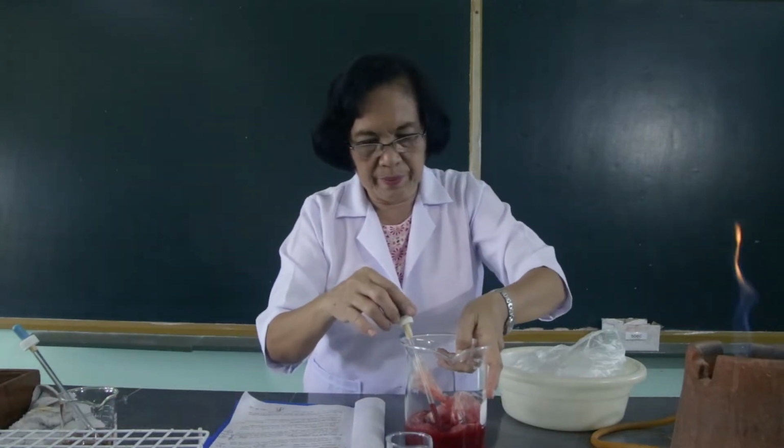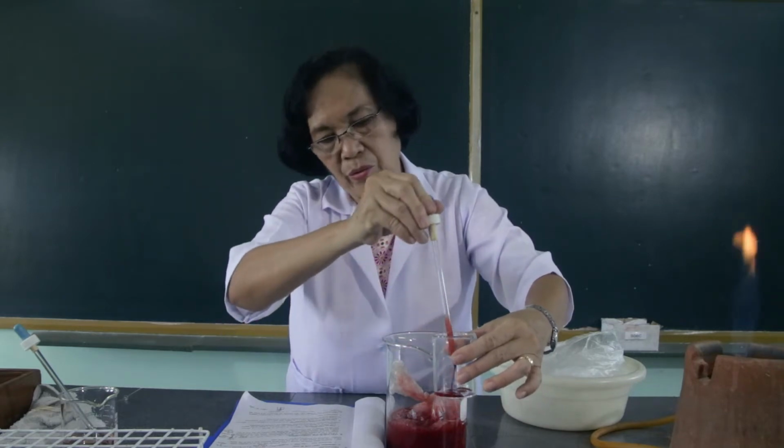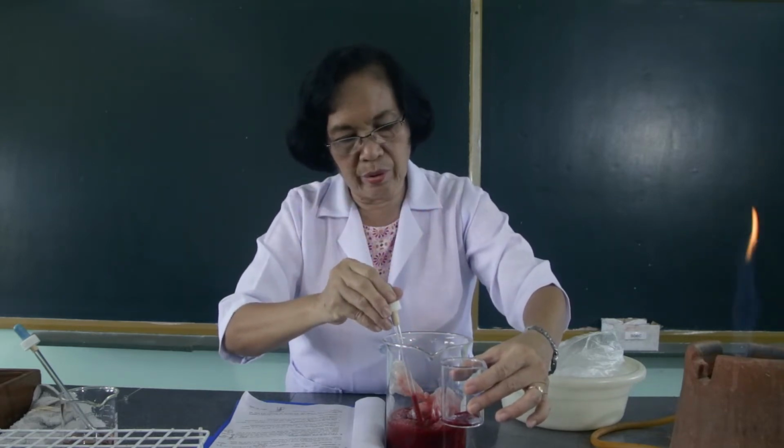The next part of the experiment is to test the blood constituents. In here, we're going to test the presence of the chlorides, the phosphates, the carbohydrates in the blood, and the iron in the blood. So we're going to use again 2 ml of the blood. Then we will add it with 25 ml of distilled water.